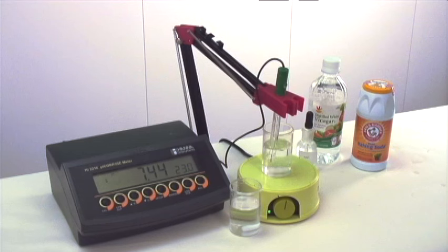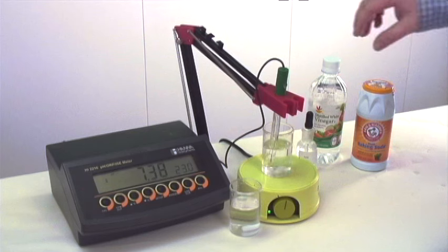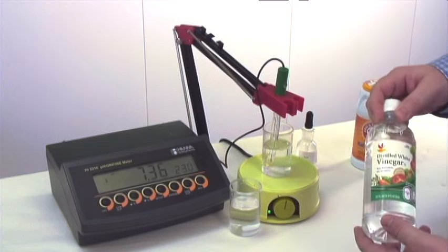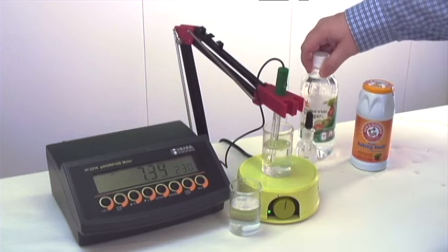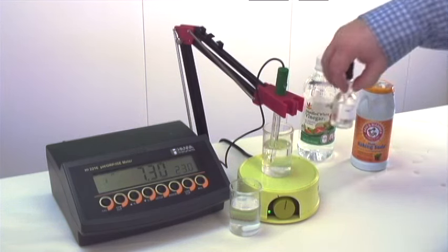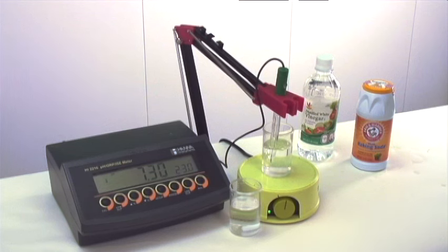We can see the pH is starting off around 7.4, and we're going to slowly add an acid. In this case, we're using vinegar, which contains acetic acid, and we're going to add it in drop by drop to see how quickly we can change the pH.